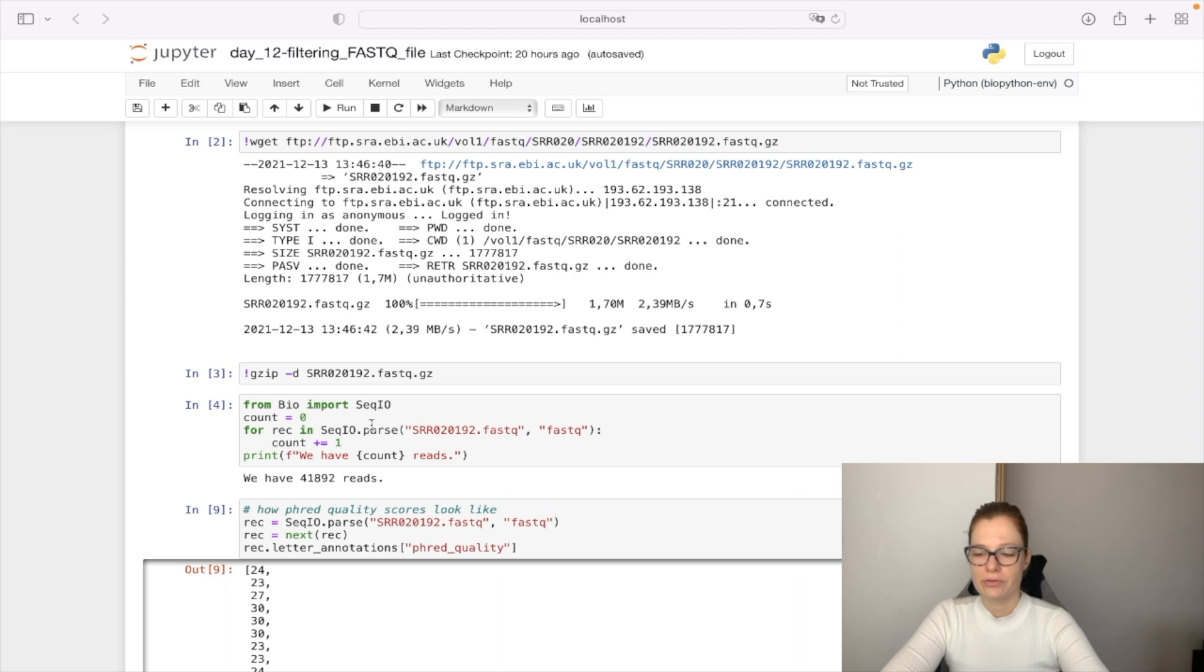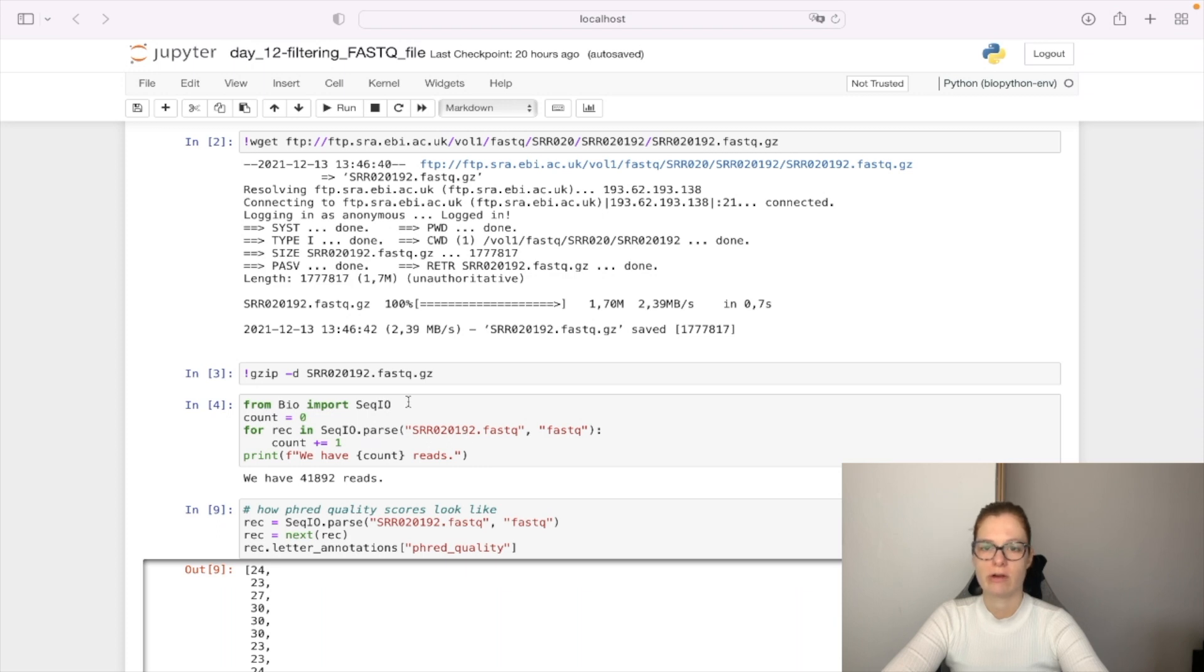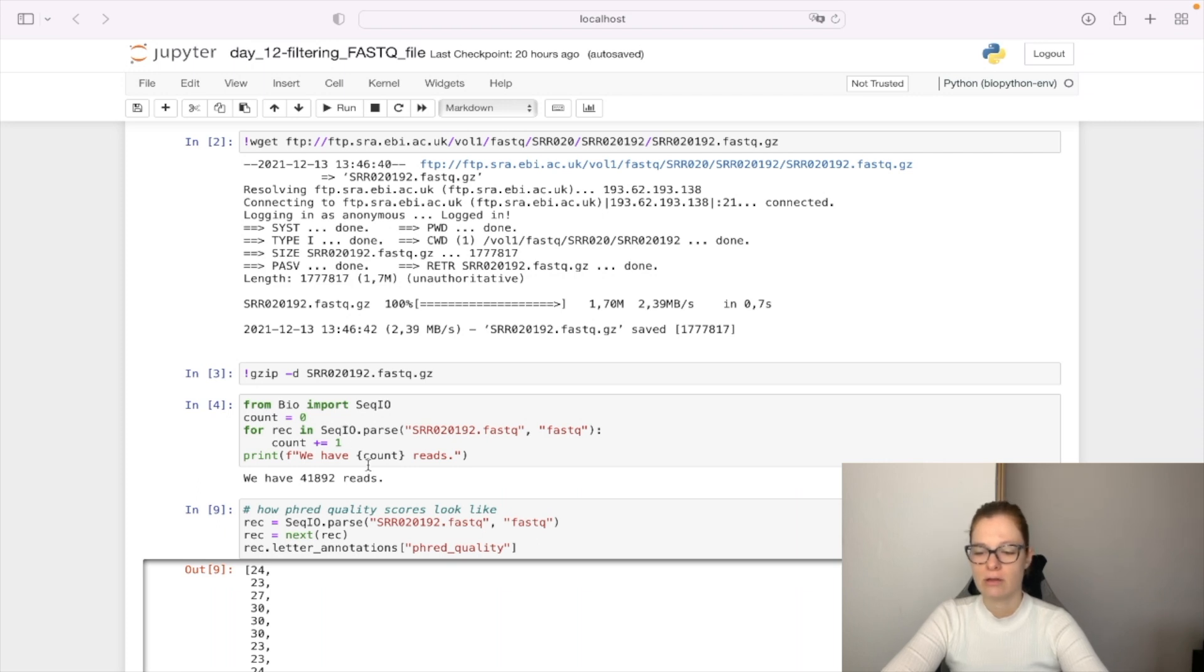First, we're going to go through this FASTQ file one by one. We parse the records, reading the sequence records one by one, and count to see how many reads we have. In total, we have 41,892 reads.